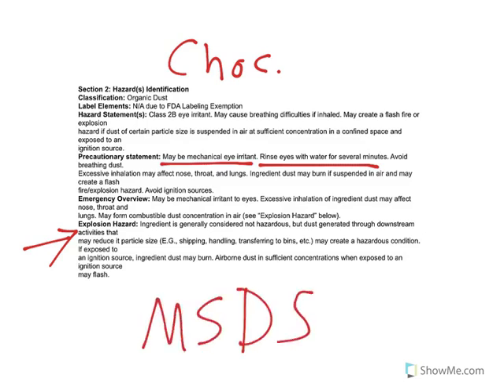MSDS. Please remember that. I think it's one of the more important things to look at, and it's a way you can truly see what kind of chemical you're dealing with. So again, please remember that MSDS.